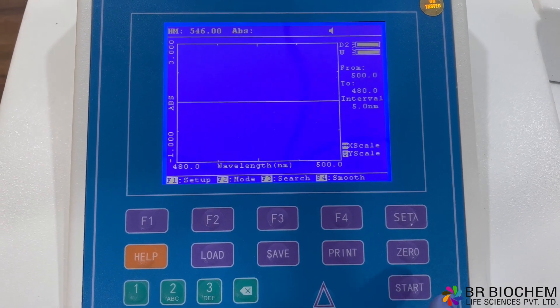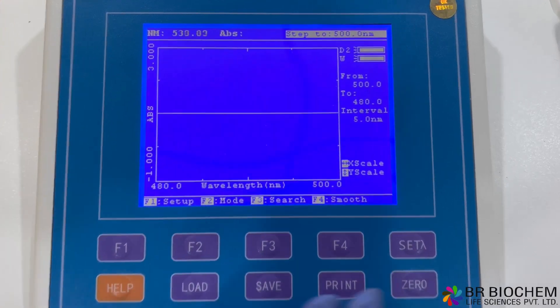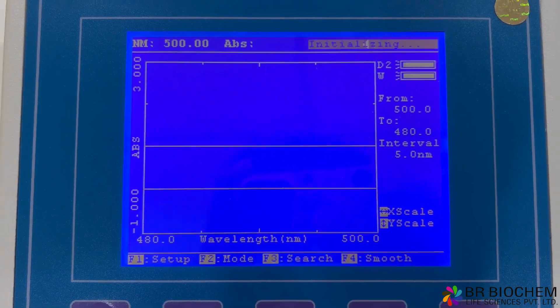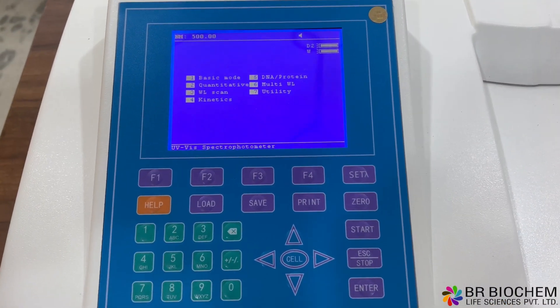The system utility provides powerful tools such as WL scan, spectrum scan, and time scan kinetics, enabling you to observe and analyze spectral characteristics and time-dependent changes in your samples.